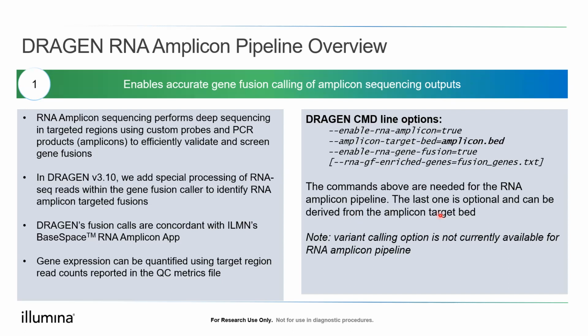Okay, and as I said, the last one is optional, and the variant calling option is not available today. This is something that we are looking at providing as a future update to this pipeline, but today there is no variant calling feature on this pipeline. We are only supporting gene fusions.